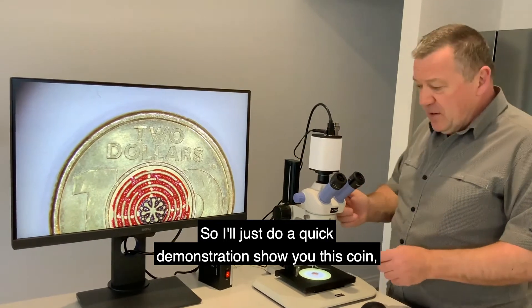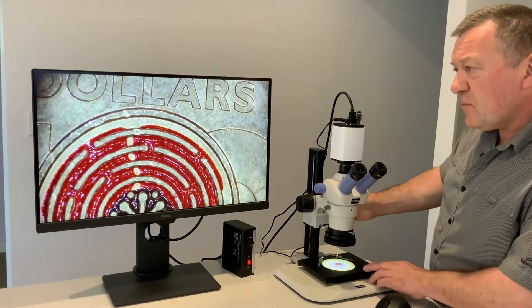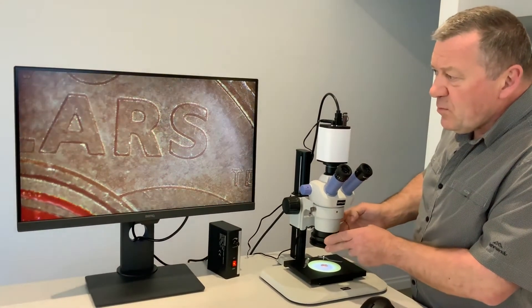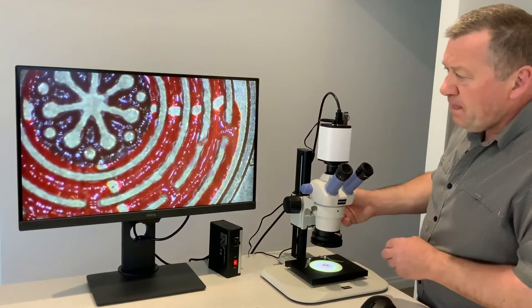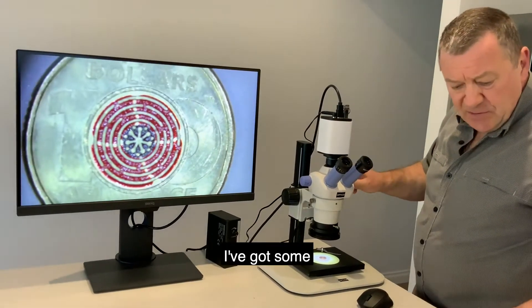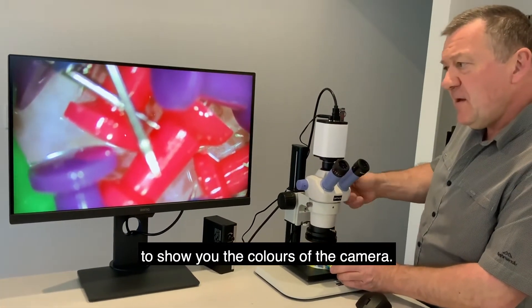I'll just do a quick demonstration — I'll show you this coin and the different magnifications. I've also got some high-colored pins here to show you the color reproduction of the camera.